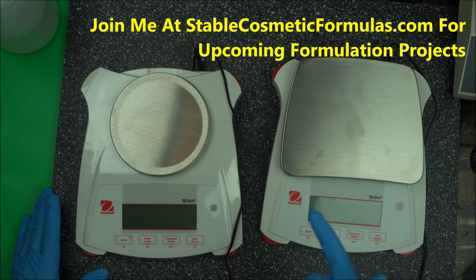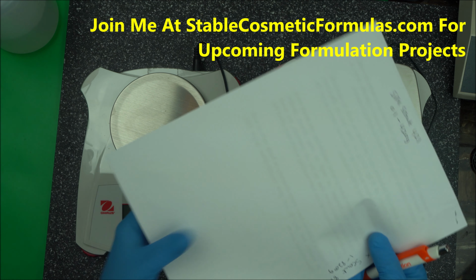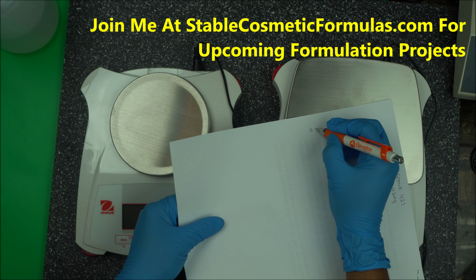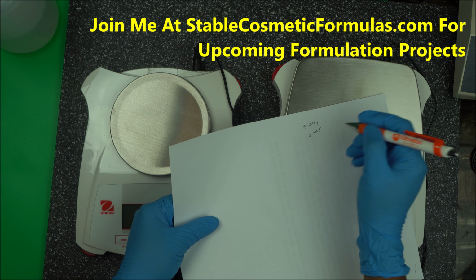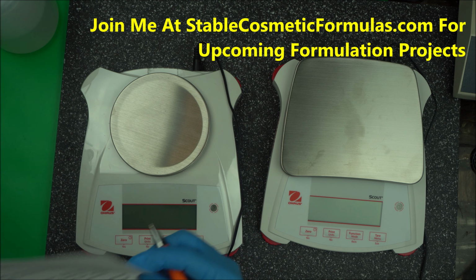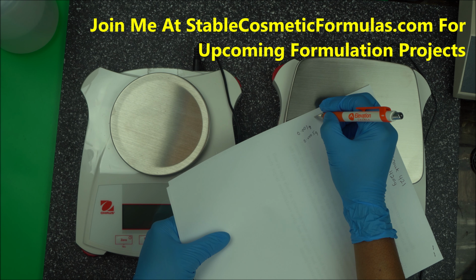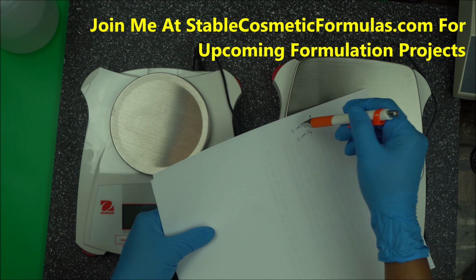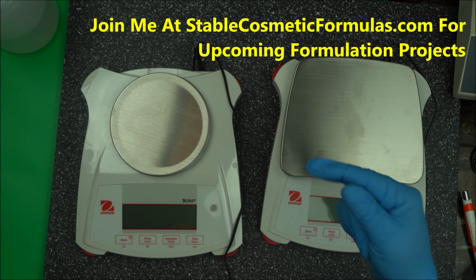Analytical precision scales are scales you use to measure small amounts, sometimes 0.001 gram, or up to 5 decimals or even more than that. Some come even lower than this, so we don't work with that, we work with grams. So that is called an analytical scale.